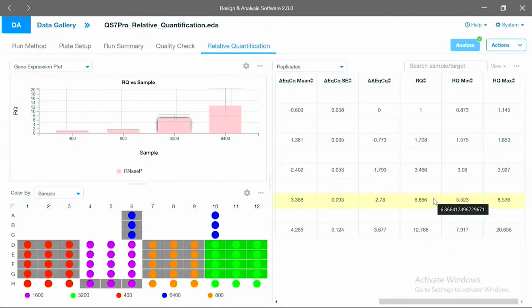And then intellectually, what should take the most time, in my mind, is picking the assays and doing your upfront work to make sure you are getting high quality data before you even set foot in the lab. There is no excuse in my mind for that. You have all the time in the world, and it only costs your time, which to me is really valuable, but to your PI, maybe not so much. So all it takes is time.